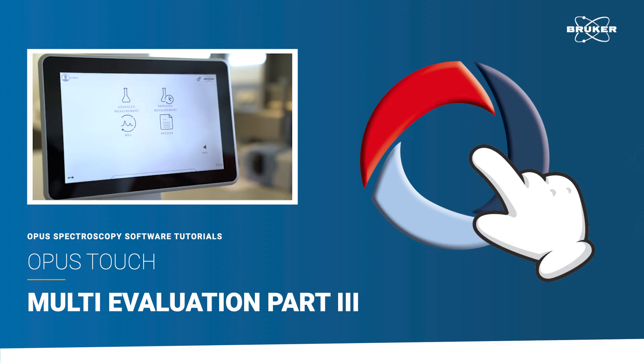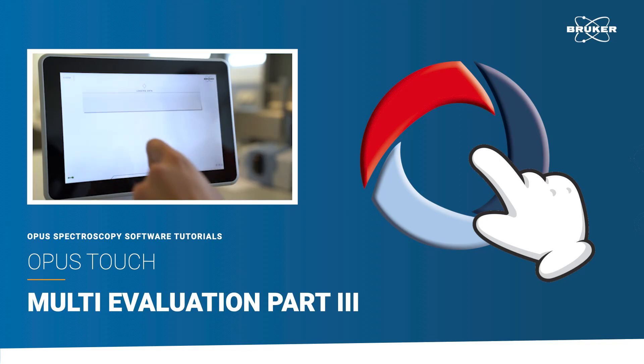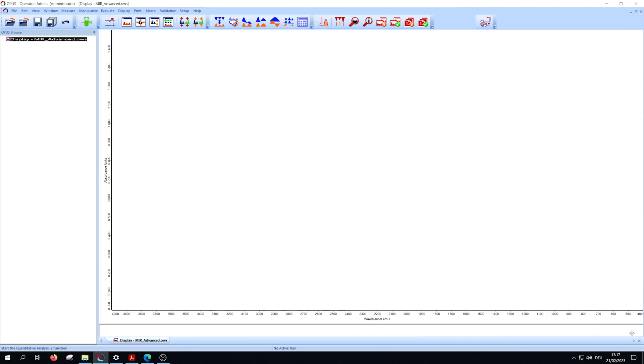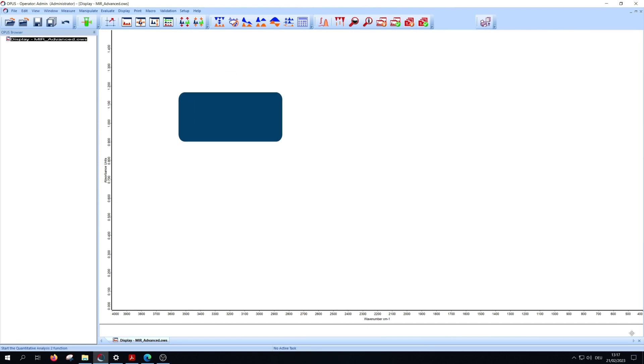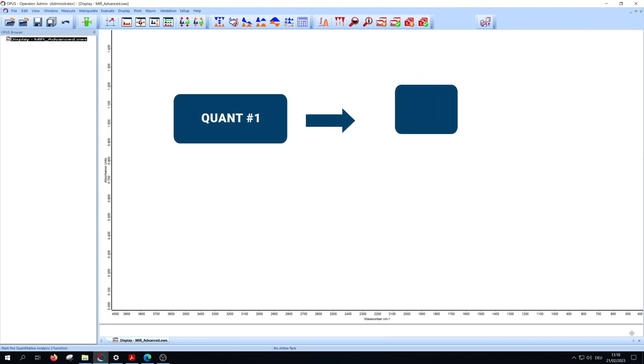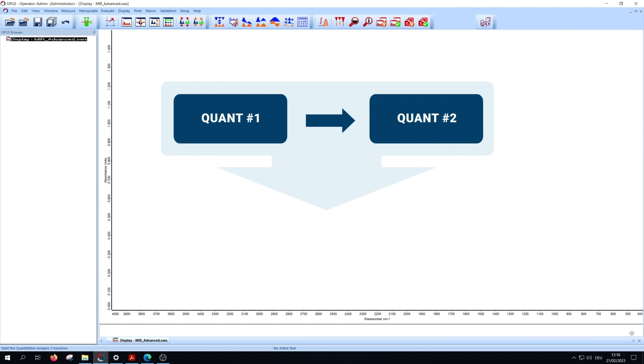Hello and welcome to the third multi-evaluation method tutorial. In this video we will work with the next step QUANT2 analyzes. A single component of a QUANT2 method can be further analyzed by adding a second quant method to this component.